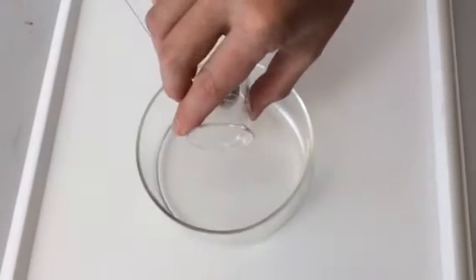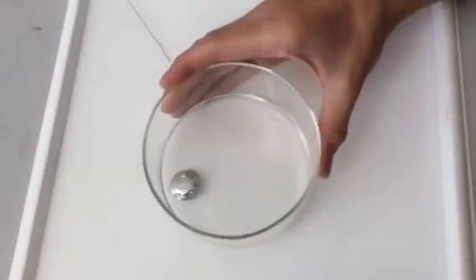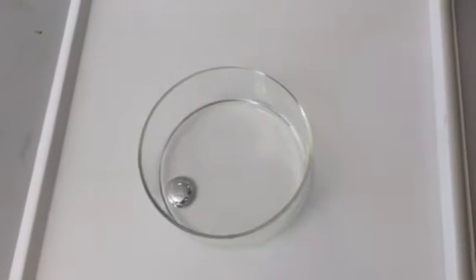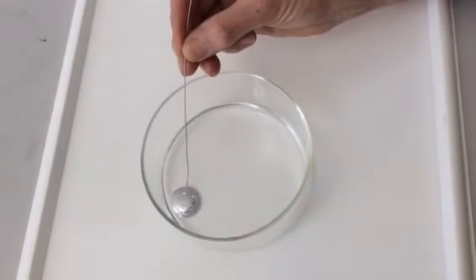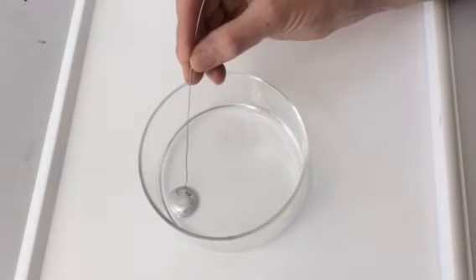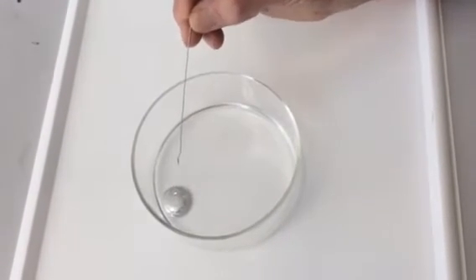Pop the gallium in. You can see that the gallium is like a bullet. And then we're going to add a piece of iron. It kind of like moves a little bit, a tiny bit.